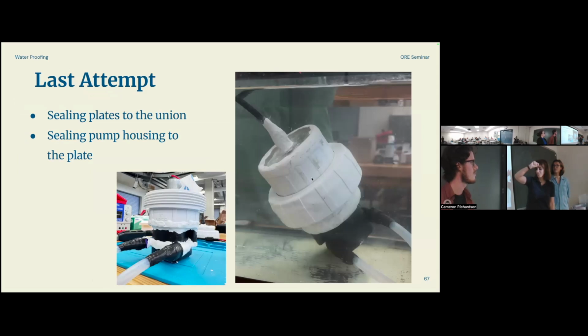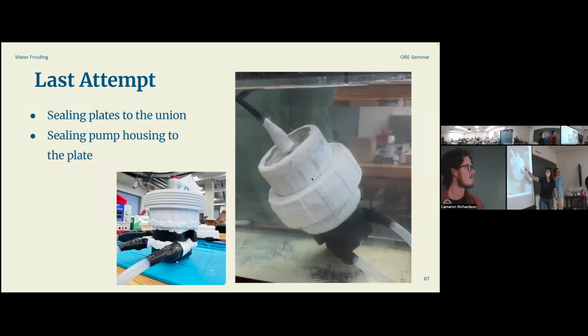One interesting thing: when I wanted to apply the putty here, at first I forgot to put the ring on, and I just simply kept this one and applied the putty around this and let it dry. And after that, when I wanted to put the ring on, I saw that I could not, because the putty here was very thick and it didn't let the ring on.